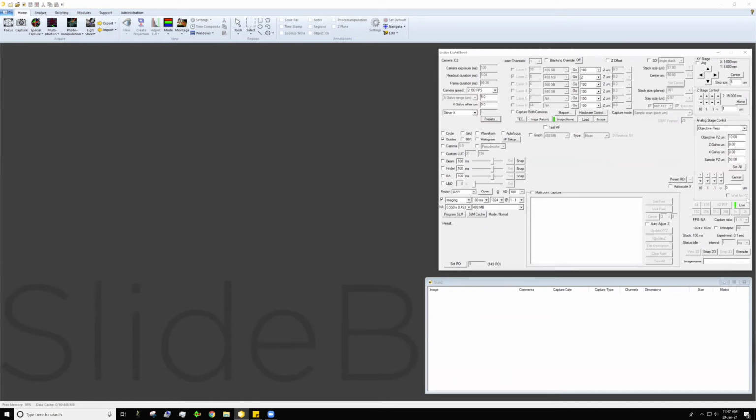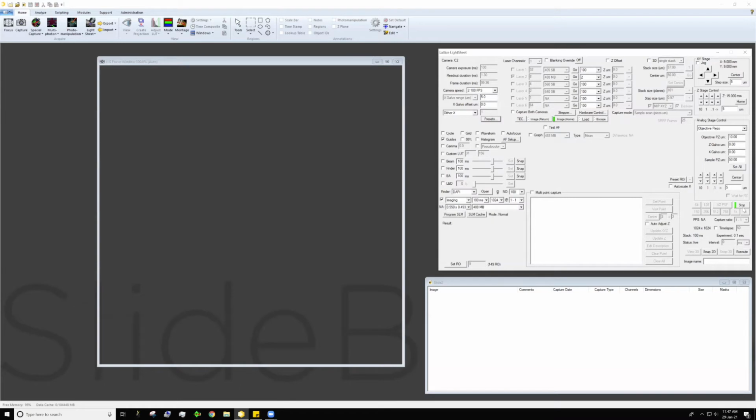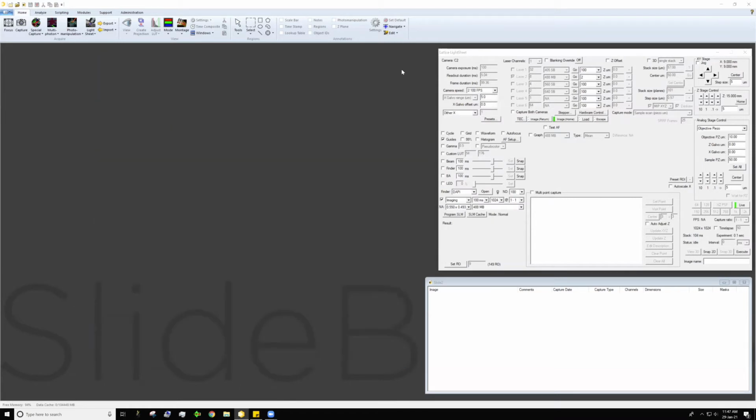If the live button is green, you can click to open the live view. If it is red, you need to program the SLM first. If you are prompted to program the SLM now or at any stage in the imaging, click No, press Stop, and then manually trigger Program SLM. This works more reliably than clicking Yes.